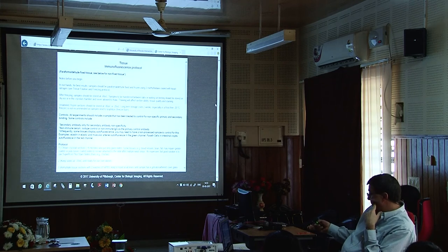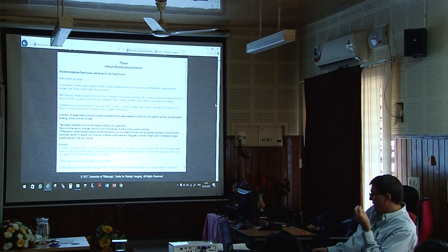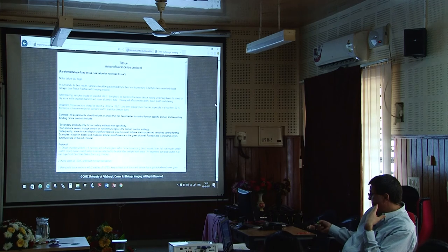So in their hands, for best results, samples should be paraformaldehyde fixed first and frozen using something like 2-methylbutane cooled with liquid nitrogen. What we used to do, pretty much like this, because you want to freeze these samples. Now what they're talking about here is you could keep these samples frozen at minus 80. Don't freeze at minus 20 if you can avoid it. Freeze at minus 80, okay?